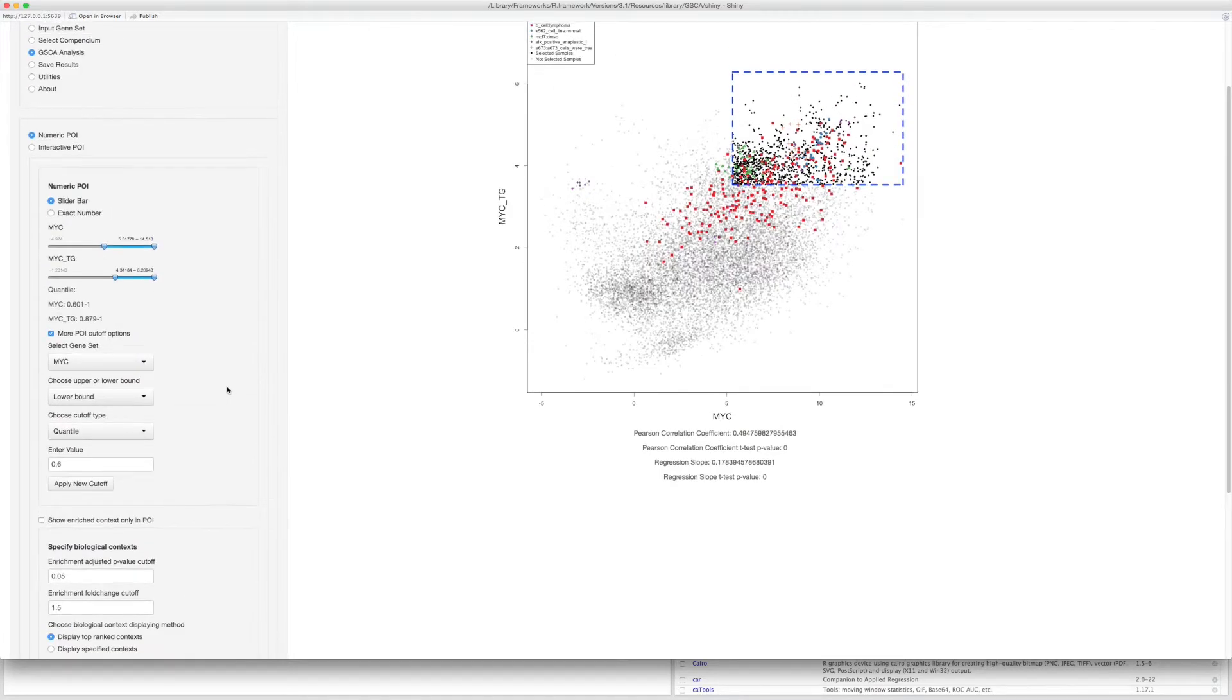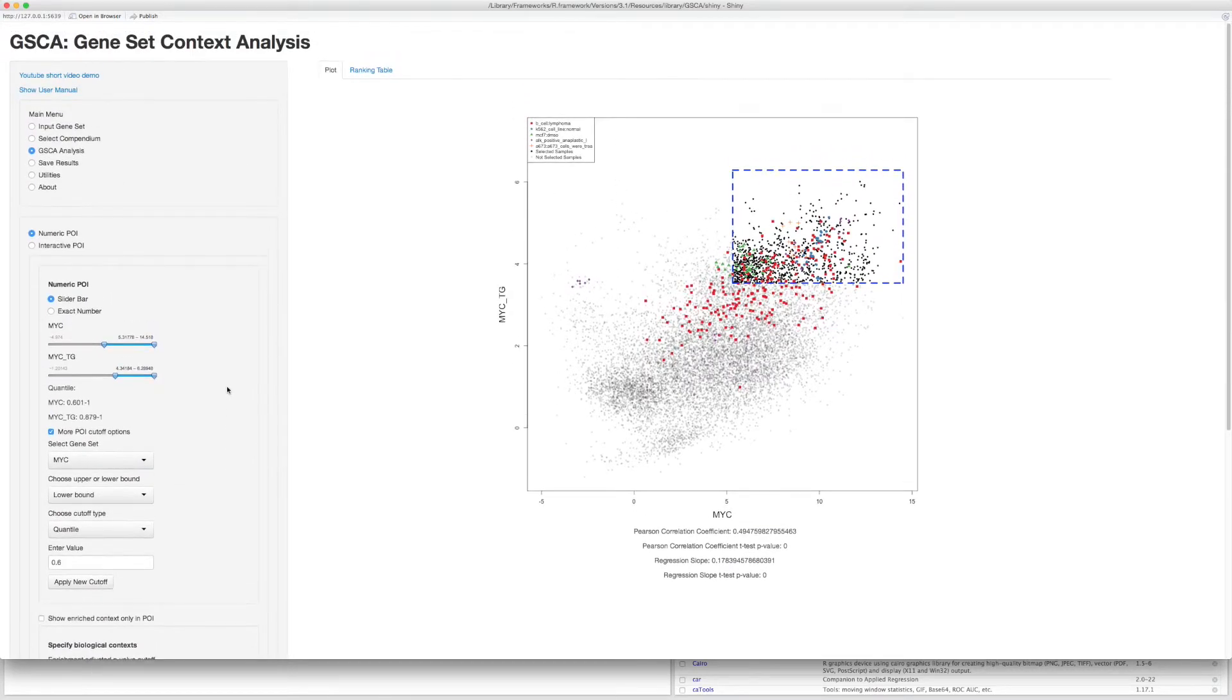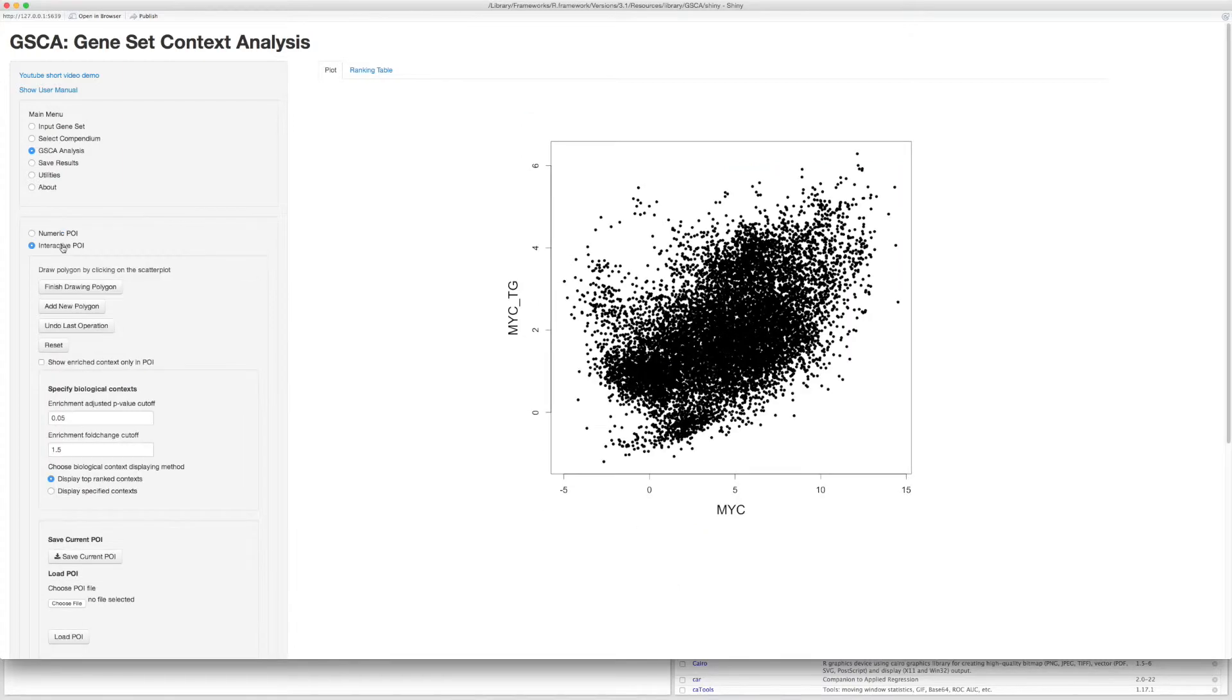To interactively specify gene expression pattern of interest, choose interactive POI. Now you can specify the POI by drawing polygons on the scatter plot. Start drawing by clicking on the plot.